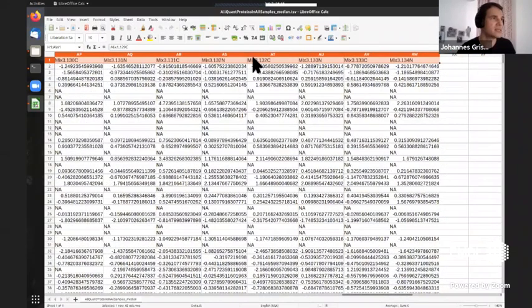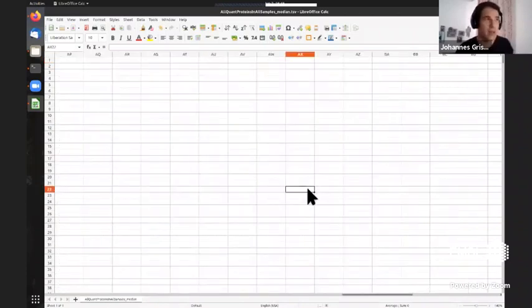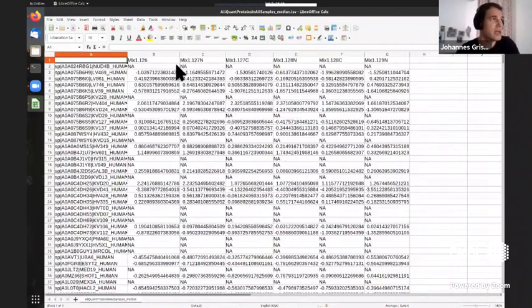You can do all of this in Excel, and I actually recommend you have a look at your data before you send it to us, because that can save you a lot of time in the question. So now we just have 6 samples here. And I'll start with this, because this is really the stuff where we got like 3 questions a day, or a week, let's say.